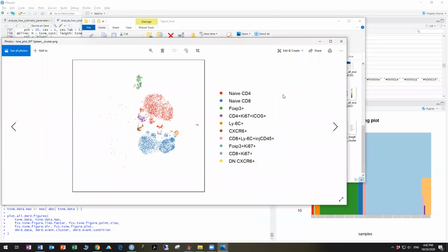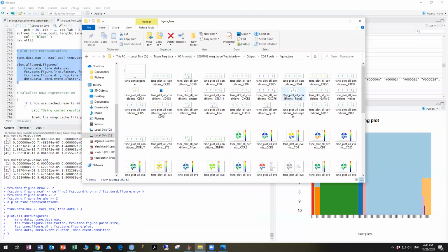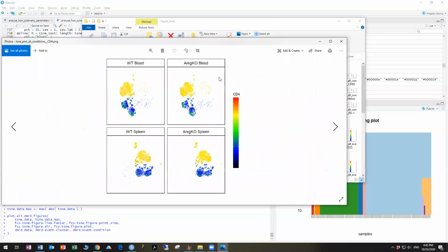And so let's keep an eye on, say, this one, where we have, see this plot right now, this text size has been chosen to be appropriate for this. And because we've changed the size of the plot, we'll now see how that works out without changing the text. So now you can see my new plots here, which are now designed the way I wanted, with 2 rows instead of 1 row.